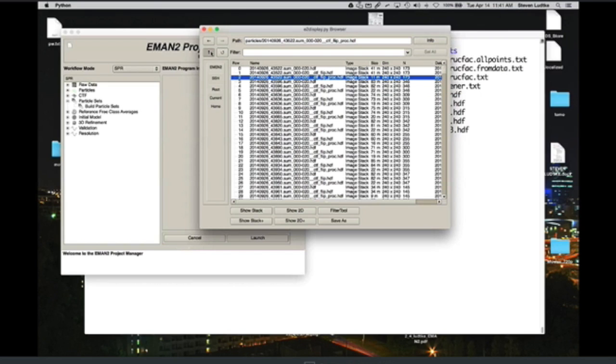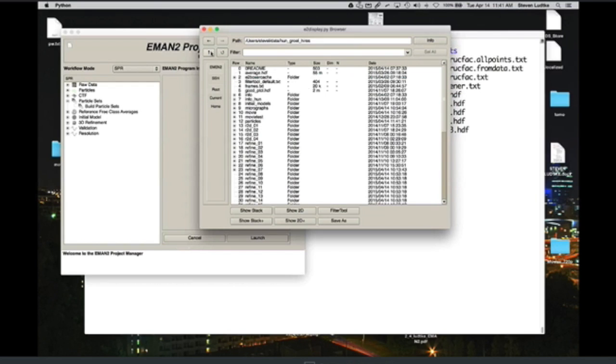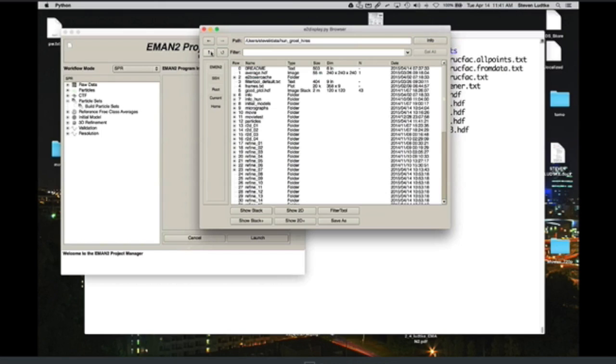So there's a question of how you deal with all of this data from different images. If you knew from the start that you were just going to want to process all of the data from all 500 images, then you could just merge all the data into one big file and have at it. But the practical reality is the data quality isn't the same across all of the images. You may want to work with only the best 10% of the data. You may want to work with the best 50% of the data. You may want to compare what you get when you work with the best fraction of the data with what you get from the worst fraction of the data. There are various things you might want to do.